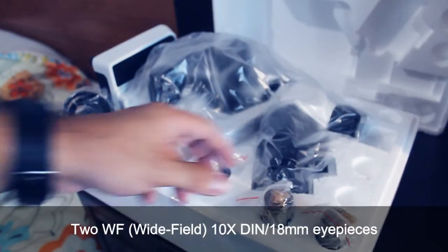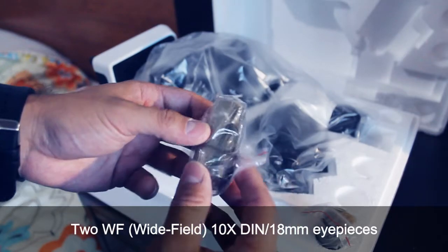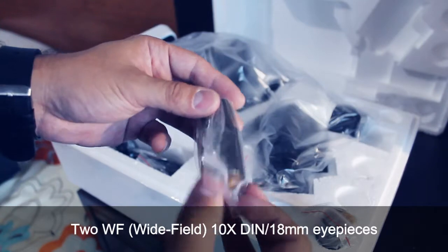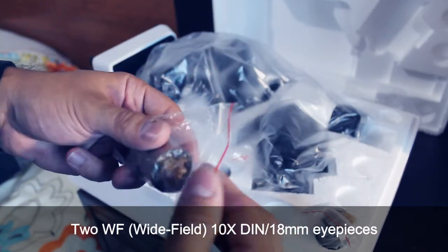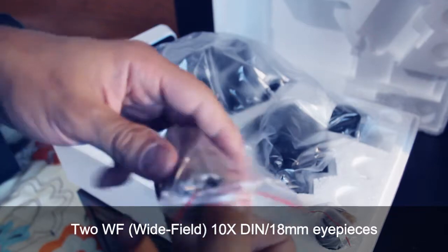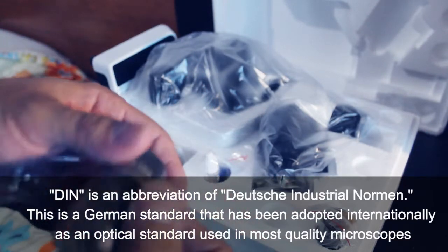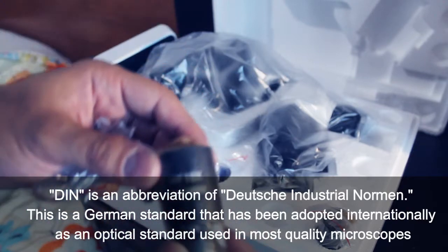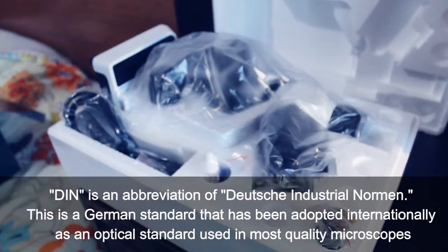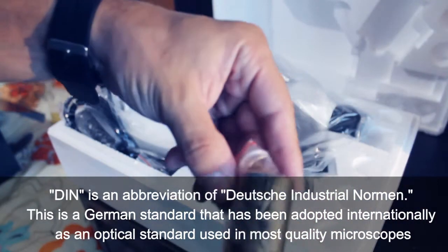This microscope comes with two wide-field 10x DIN eyepieces. With the eyepiece and a chosen objective lens, you can choose the magnification of the microscope. The eyepiece is inserted into the head from above. DIN stands for Deutsche Industrial Norm — a German standard that has been adopted internationally as an optical standard used in most quality microscopes.